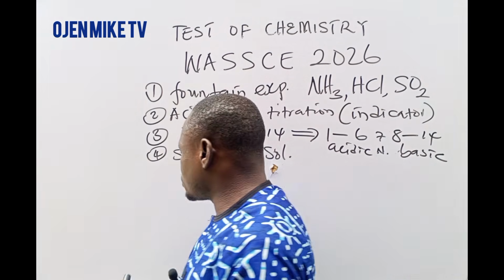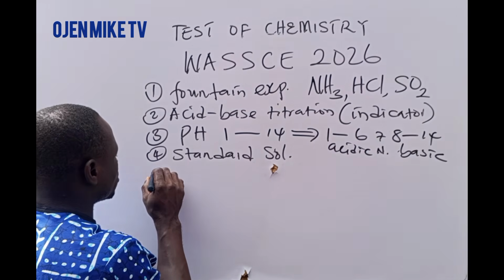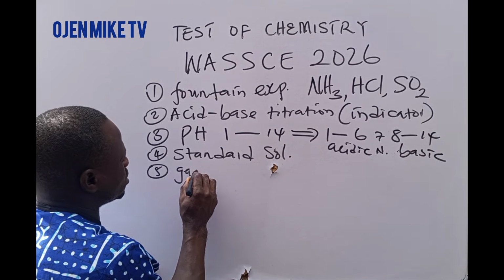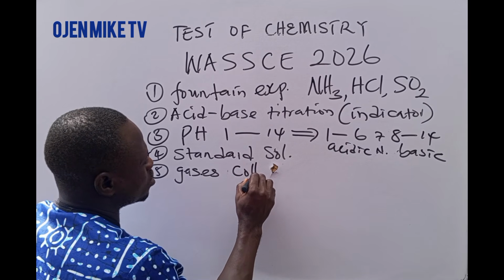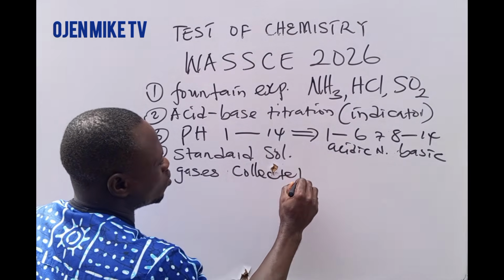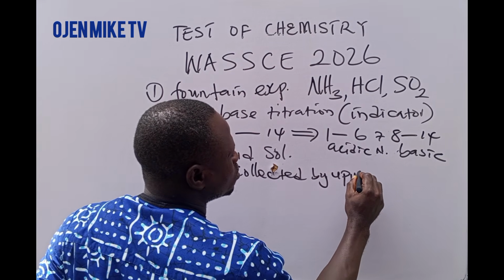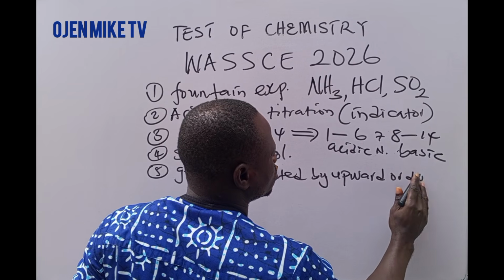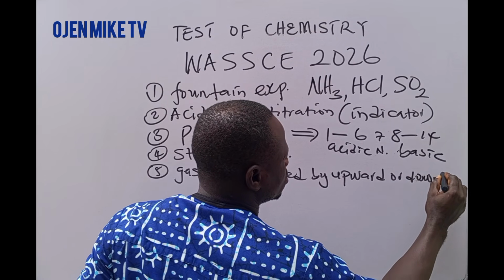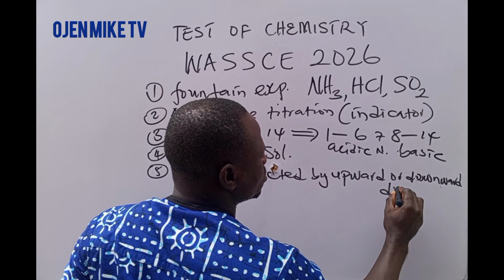The next one is gas is collected by upward or downward delivery.